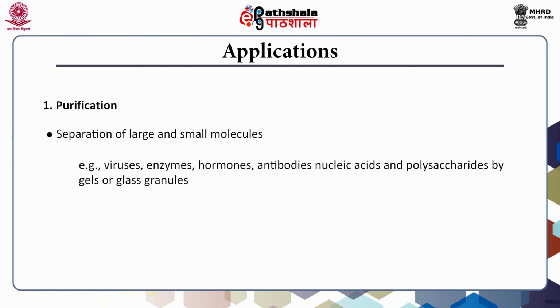Another important utilization of gel filtration chromatography, like dialysis, is desalting. Because salt molecules are smaller in size, when we want to separate our bigger molecules from the smaller molecules, still like in dialysis we can use gel filtration chromatography for desalting. The next similar application is solution concentration. Basically, here also we are separating different sizes of molecules and making the solution more concentrated.